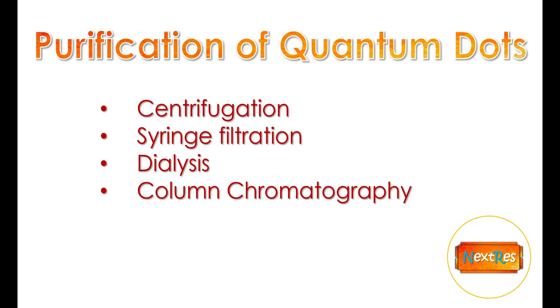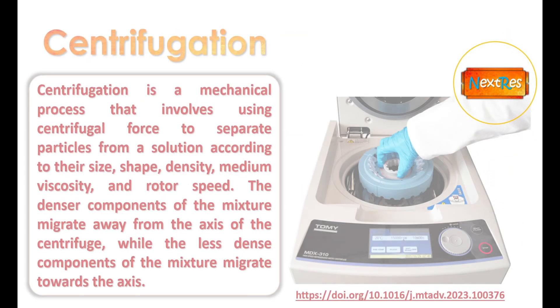These are some of the general purification techniques used in the laboratory, namely centrifugation, syringe filtration, dialysis, and column chromatography.